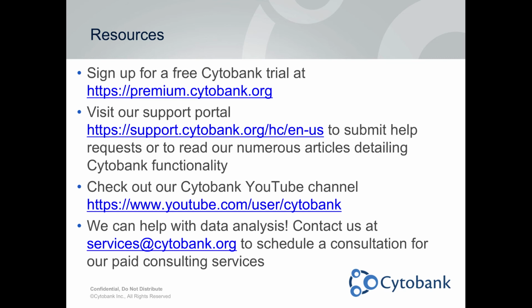Let's see. This question says, how does Cytobank remove the Treg gating bias? This is probably for Shahram. How does Cytobank remove the Treg gating bias that Dr. Kordasti highlighted earlier in the talk? So probably interpreting this, maybe, how did you use Cytobank tools to remove the gating bias talked about?